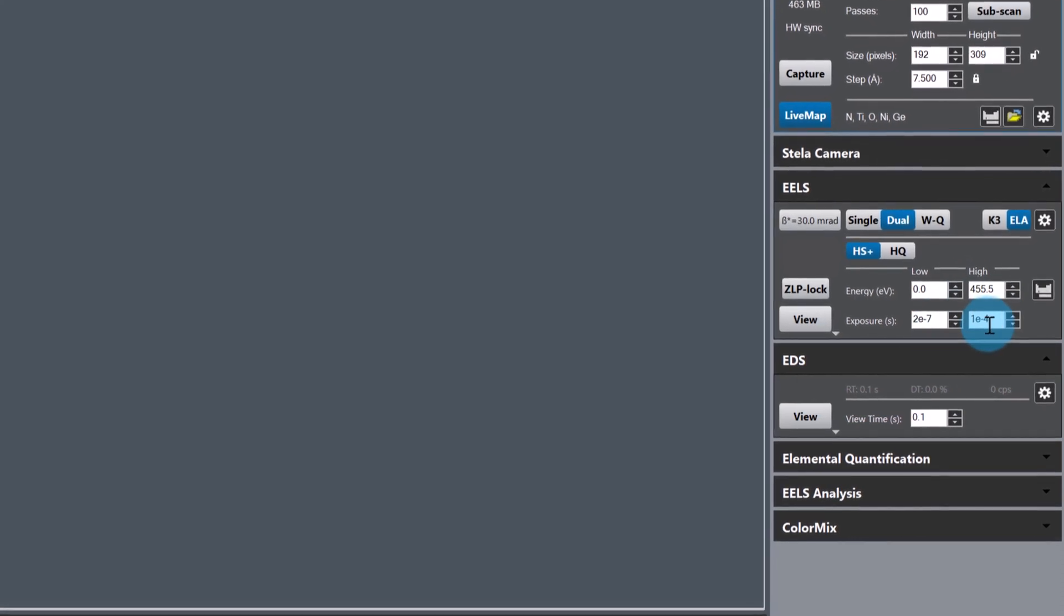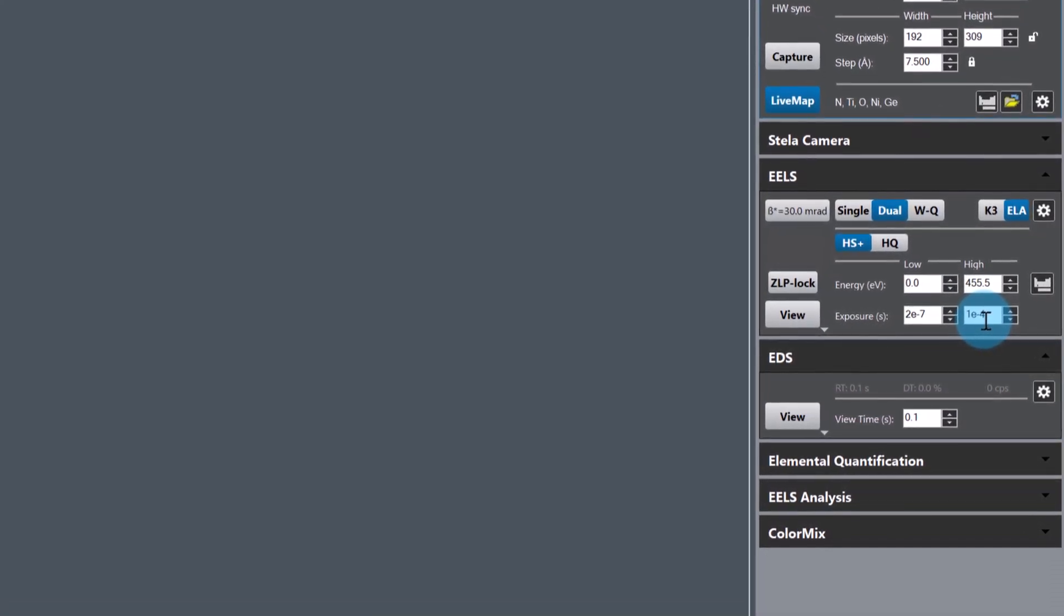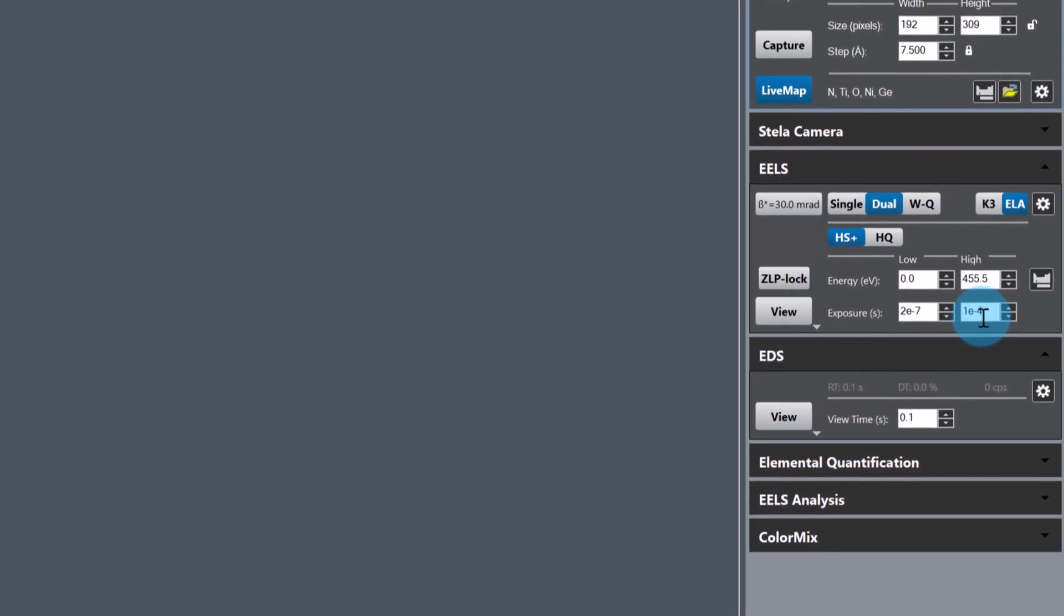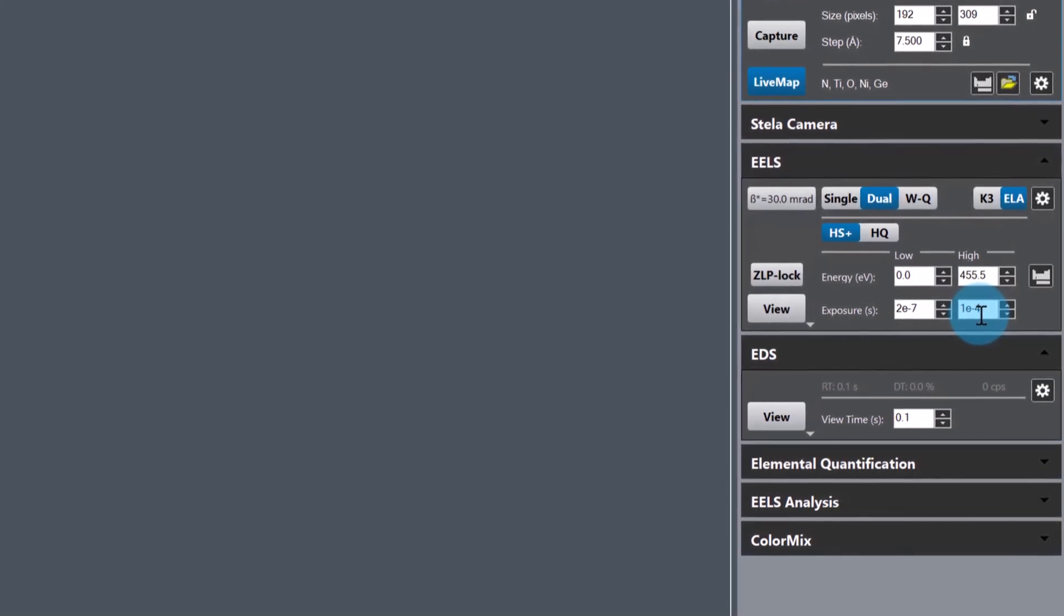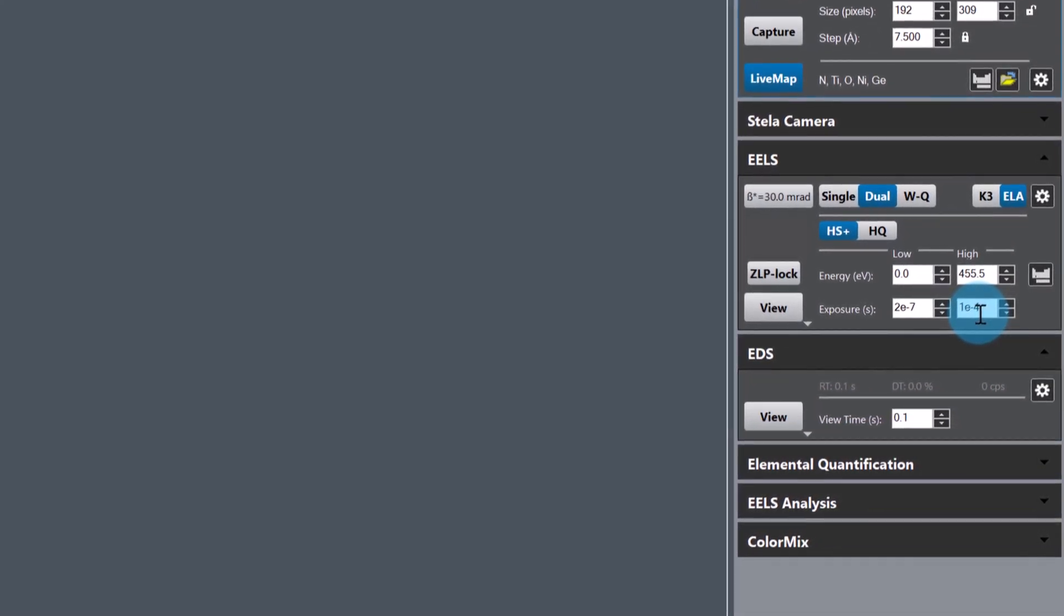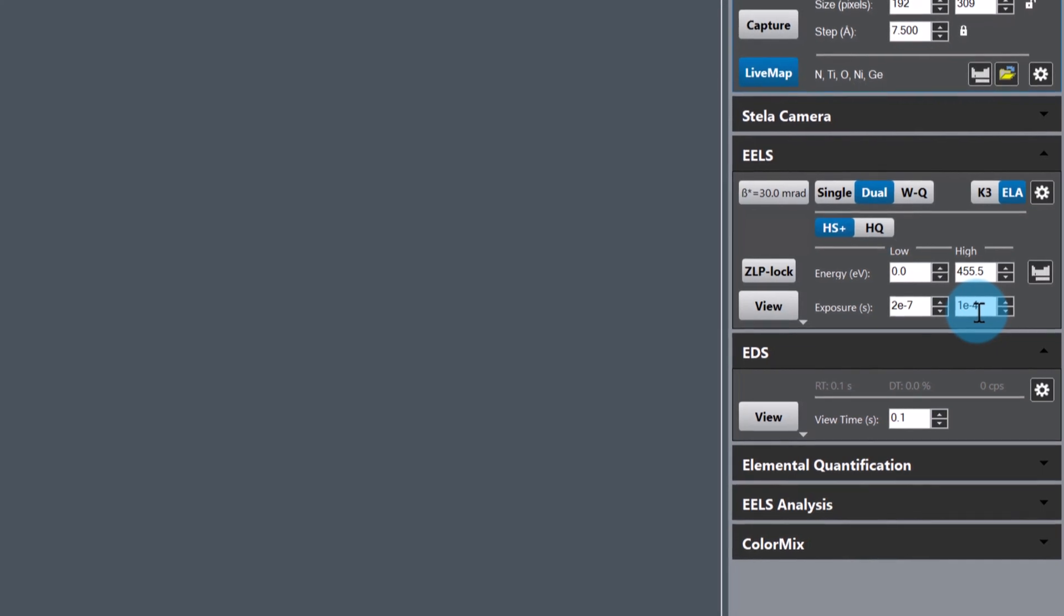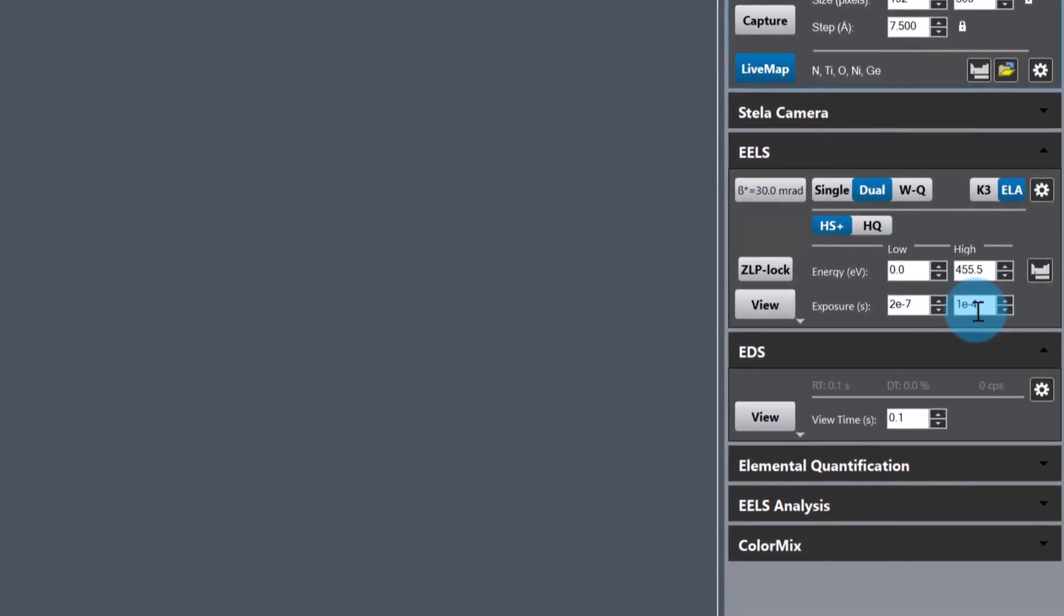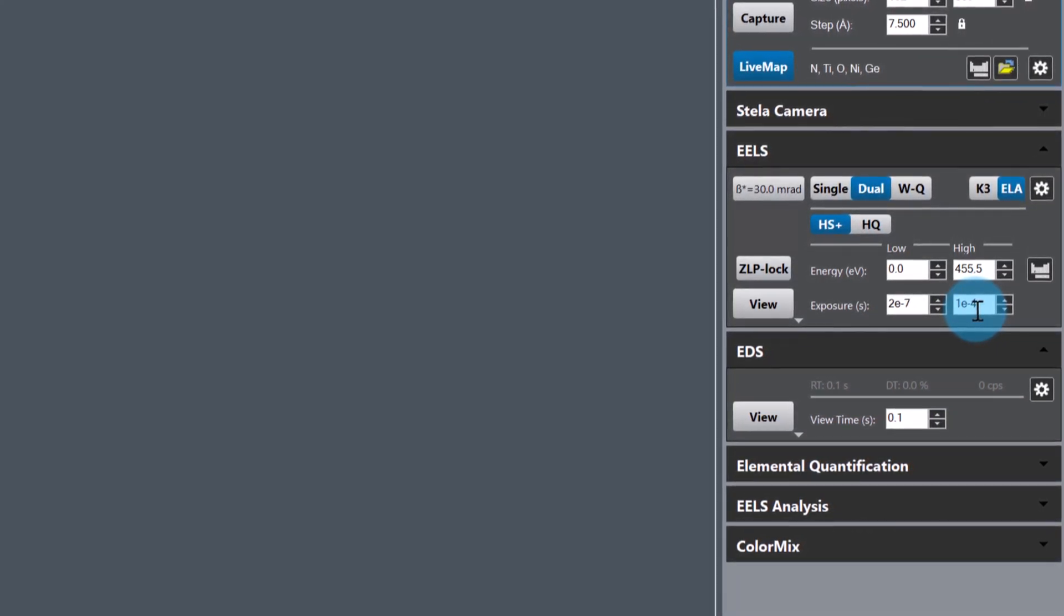I've chosen zero EV for the low loss so I can capture the zero loss peak for energy calibration and low loss spectra for plural scattering correction. I'm using a very short exposure time of 0.2 microseconds to avoid saturating the CCD.